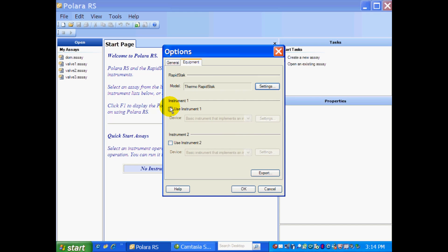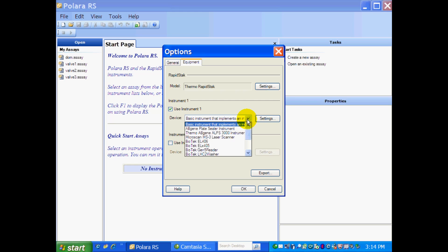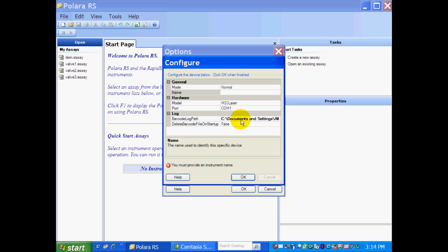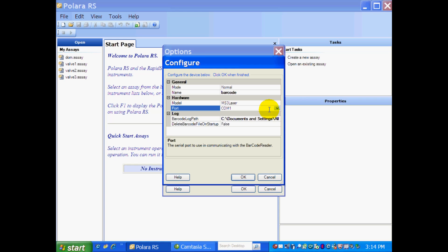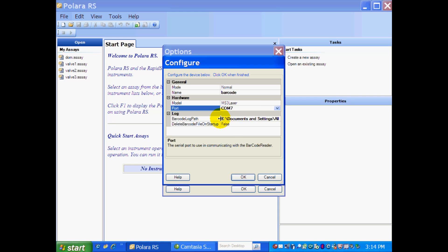Next, we're going to use Instrument 1. And this is going to be our barcode reader. So we just pull down. The barcode reader is the MS3 laser scanner. And again, we have to select the settings. So again, the mode is going to be Normal. We have to give the barcode reader a name. I'm just going to give it barcode. It is an MS3 laser scanner. And I am on COM7.